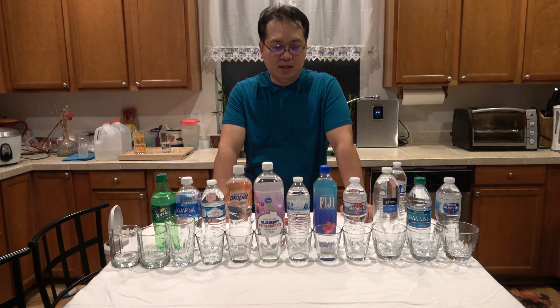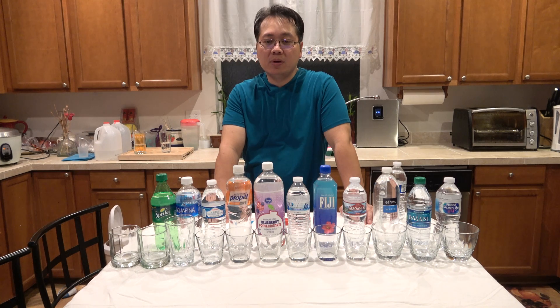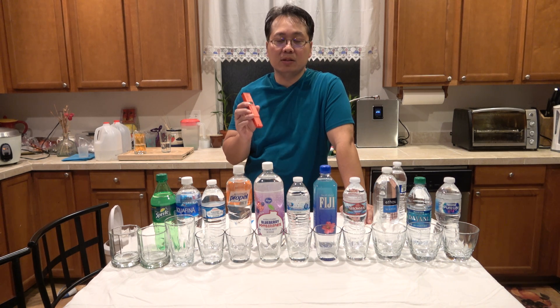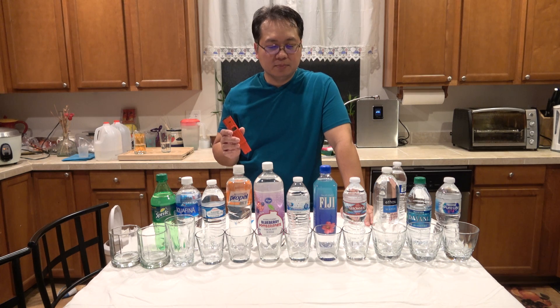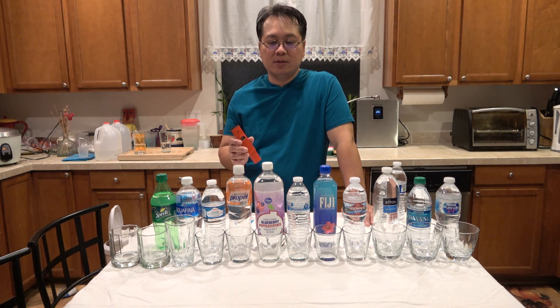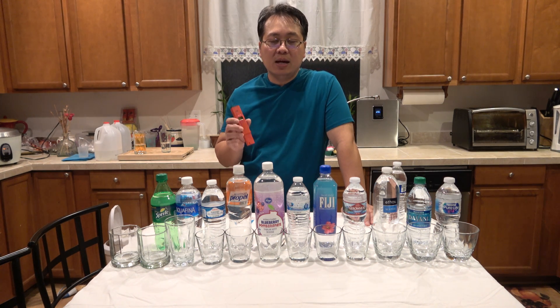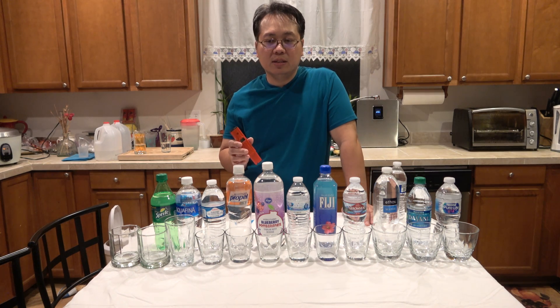Hi, this is Ivan Fernandez and I'm here to test the different kinds of bottled waters and tap water and compare it to my ionized alkaline water. I'm going to test it using this ORP meter. ORP stands for oxidation reduction potential and what it basically does is it tests the levels of antioxidants that the water has. If it's a positive number, that means it doesn't have any antioxidants in them, but if it measures a negative number, that means it has a lot of antioxidants.